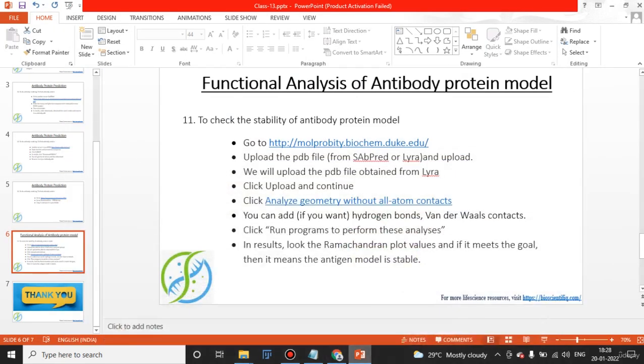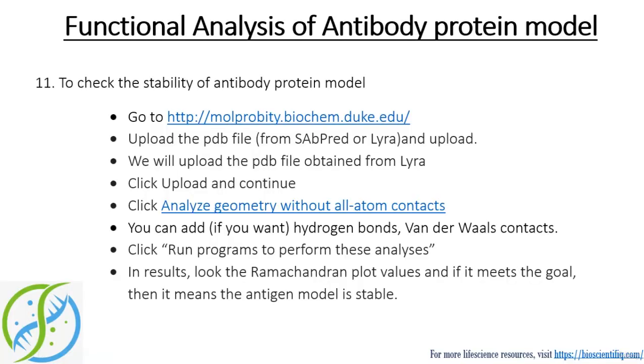So that's all about the antibody structure prediction as well as functional analysis of the antibody protein model. Thank you.